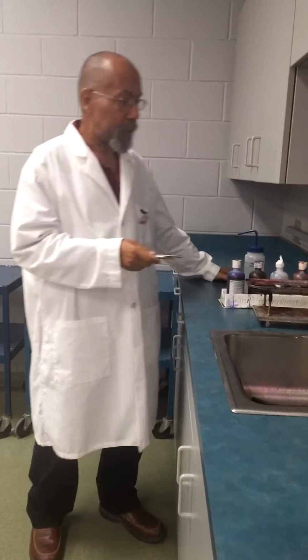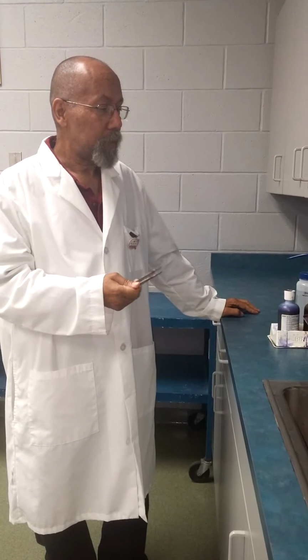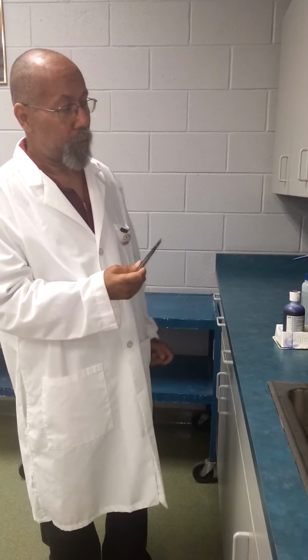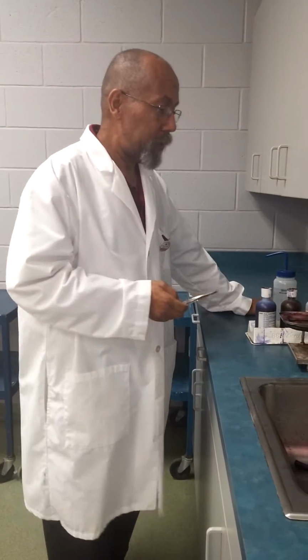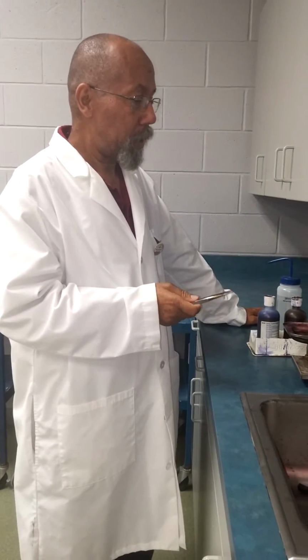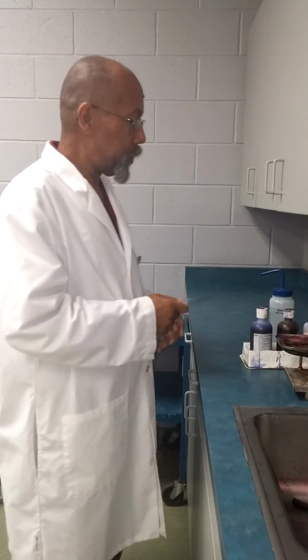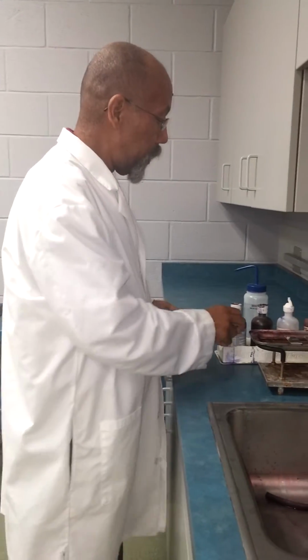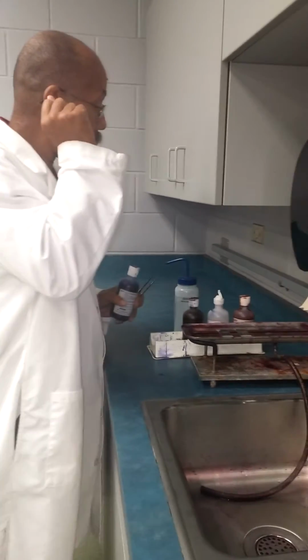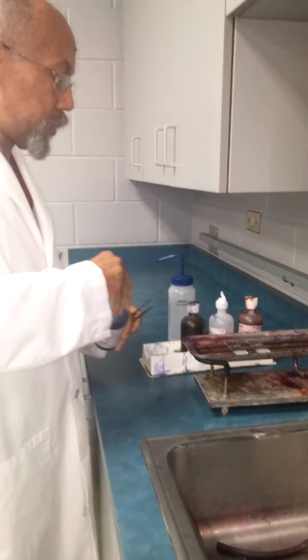Okay, today we're going to demonstrate how to do the Gram stain. The Gram stain was devised back in 1884 by a gentleman by the name of Hans Christian Gram. And this is one of the most important staining methods in microbiology. In the identification process, the Gram stain is usually where we want to start.